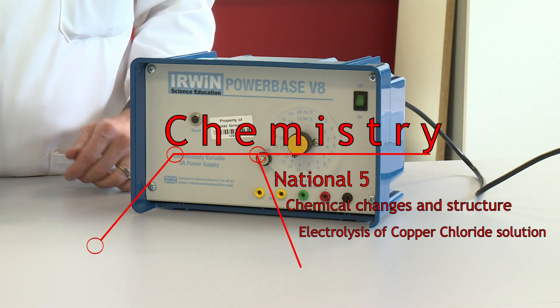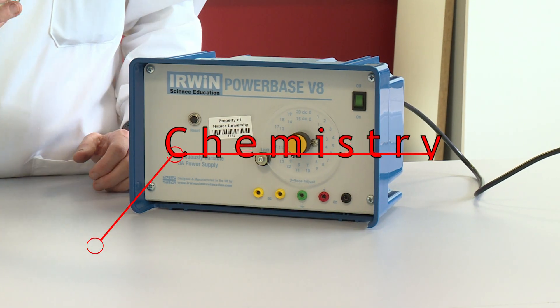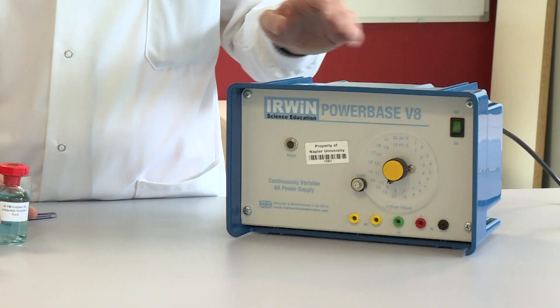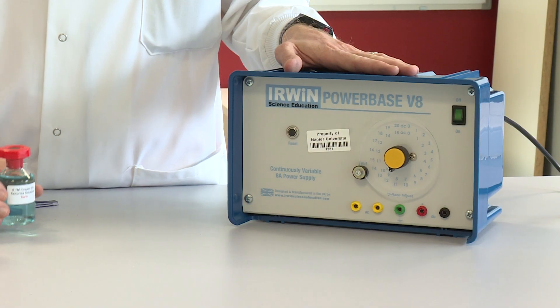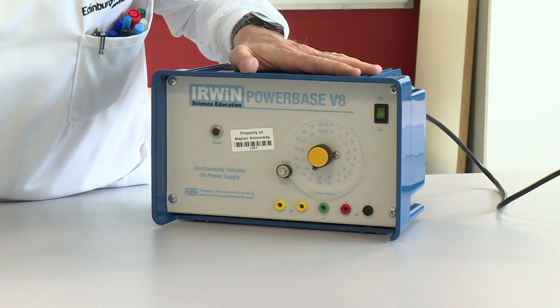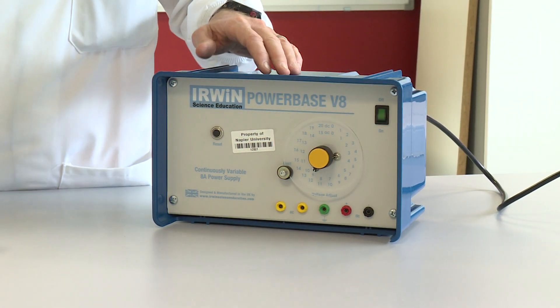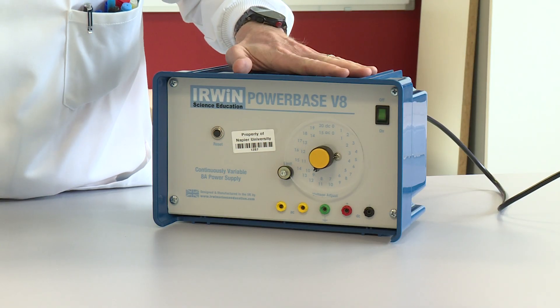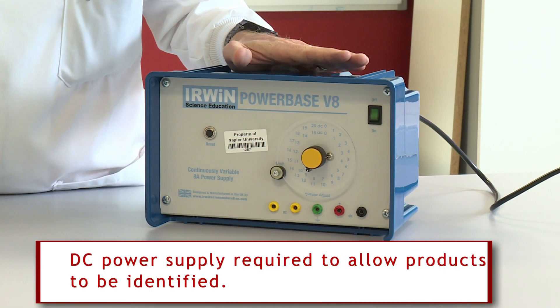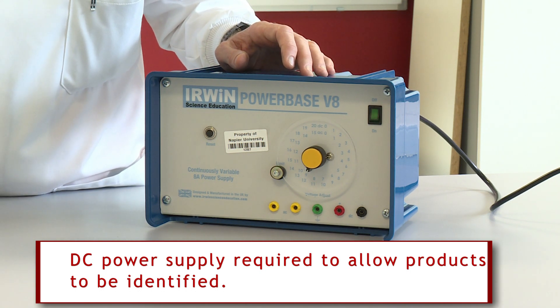In this experiment we are going to use electricity to separate copper and chloride ions. It's an electrolysis experiment, so we're separating using electricity. The power supply is set at 12 volts and we're going to use the DC power supply — direct current — so that one electrode is continually positive and one electrode is continually negative, and that allows us to separate the two ions.